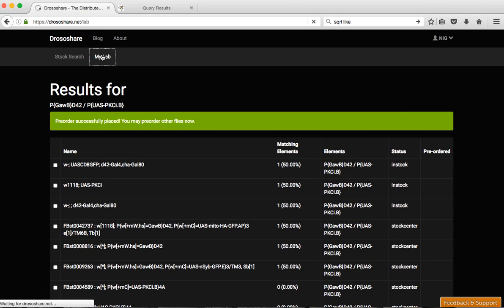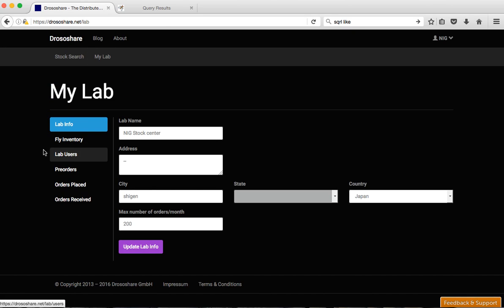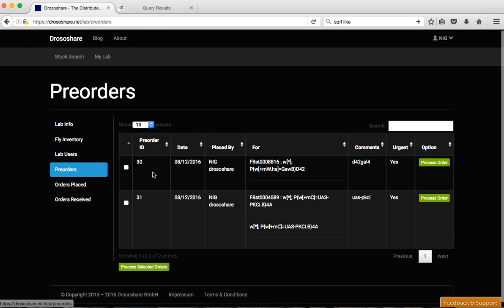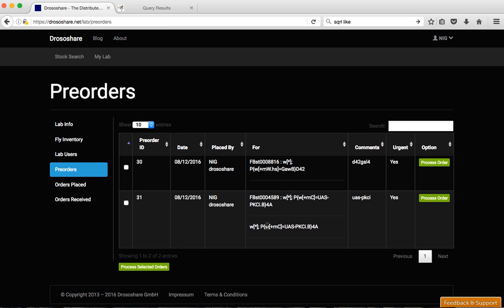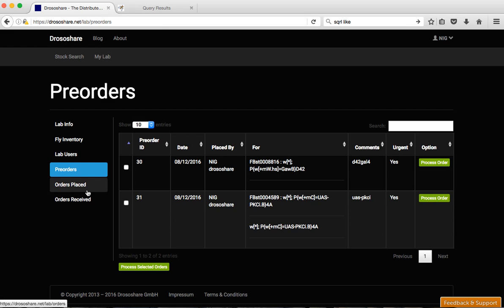Now if you go to my lab you'll see in the pre-order we have one here which is the D42-Gal4 which has only one element, one possibility, and the ESPKCI will be either one or the other. So for stock centers it doesn't make much sense but if you want to get flies in different labs it may be interesting to have different hits here such that if one lab refuse the order another lab can take it, or that you can group things to have less labs involved.